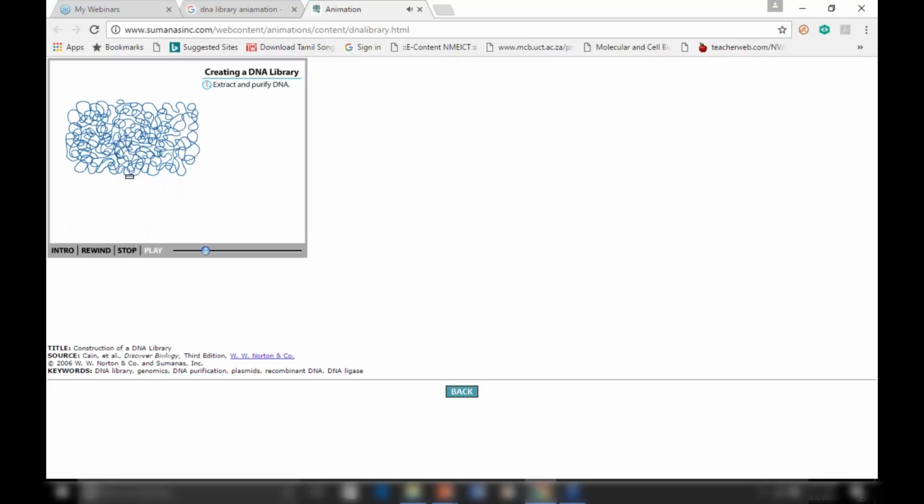To begin working with the DNA, the strands must first be cut into manageable sizes. The DNA is therefore digested with restriction enzymes, which cut the DNA at specific sequences. The restriction enzymes cut the DNA into thousands of smaller fragments, each of which may contain one or more genes. Although we show just a few fragments, let's suppose they represent all of the DNA that exists in human cells. The colors indicate that the fragments are different and have unique DNA sequences.